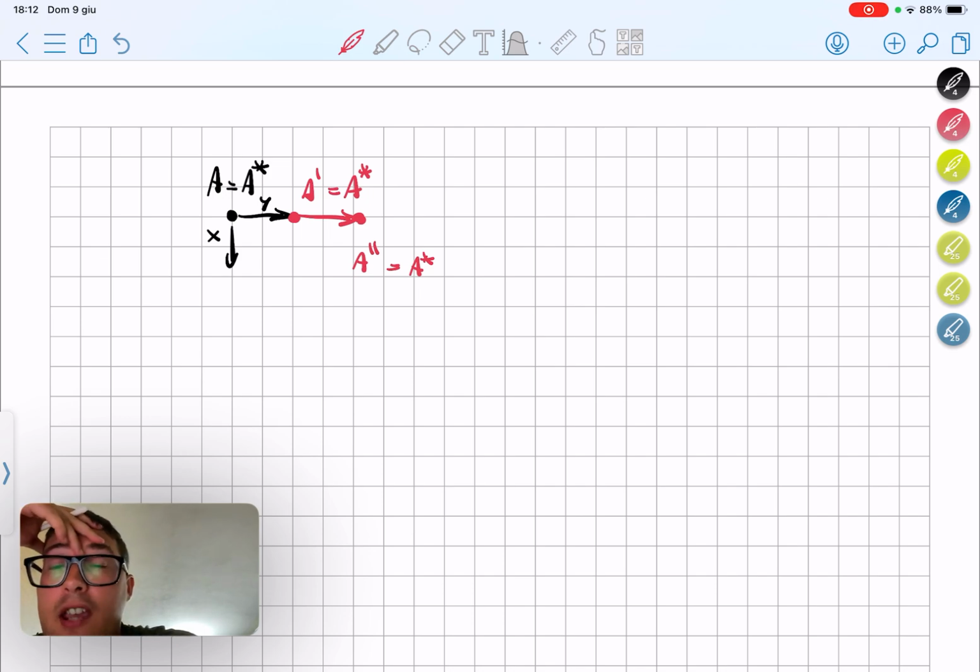In the frequency modulation, on the contrary, what is kept constant is the amplitude itself. As the tip is moving in x and y on the sample, there will be a modification of the frequency according to the gradient of the interaction forces, which will increase or decrease the frequency, but the driver will maintain the same constant amplitude.